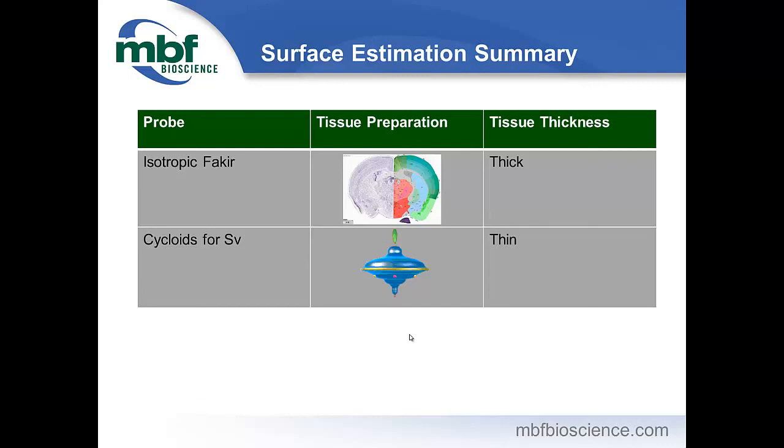If you do want a density, you can then estimate the volume using Cavalieri point counting methods, and then simply divide your unbiased estimate of the total length by the unbiased estimate of your total volume to get a length per volume value. That's why it estimates length. Yep. And Cavalieri, as I hope we've illustrated a little bit, is very straightforward to do.